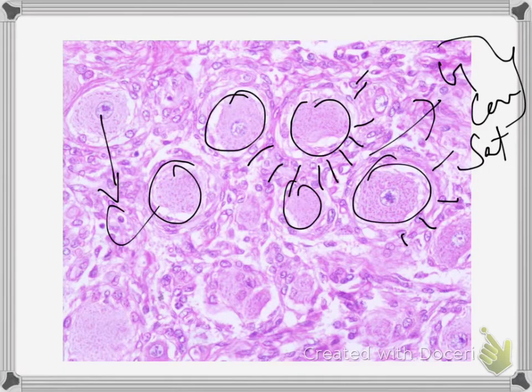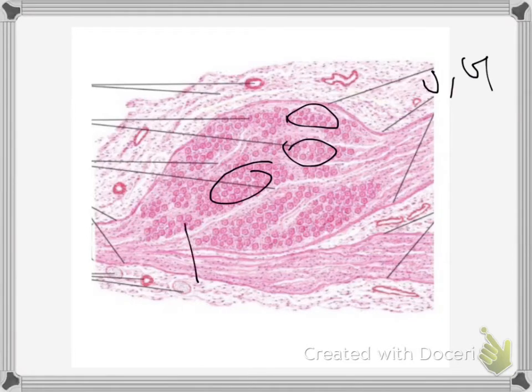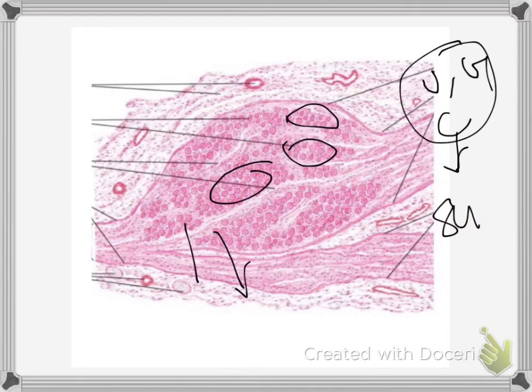Right, very good. Next, this is a picture, a magnified view. Here nicely I could see the neurons in groups. In groups means unipolar groups. I could see nicely the center dot, so it means centrally placed nucleus. These three are suggestive of sensory ganglion. Very good. Done. And I could see the nerve fibers in between.